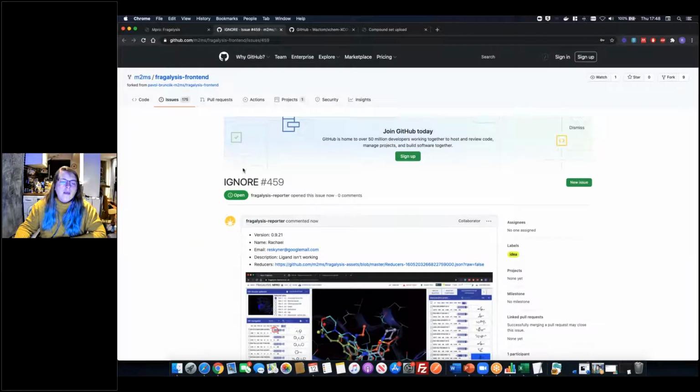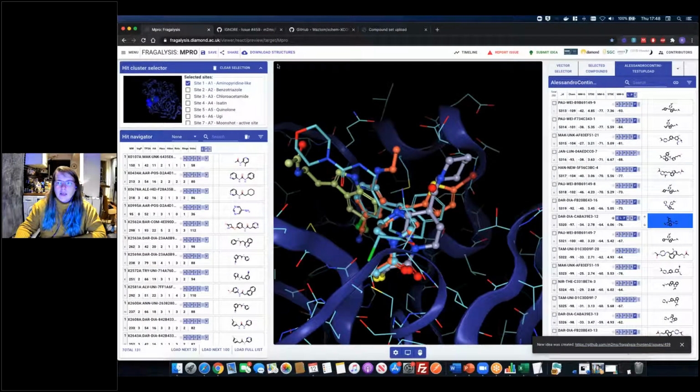And the ideas thing works in exactly the same way. So if you had, for example, a slide or something articulating your idea and you wanted to include that in your image, then when that pop-up comes up to share something, just share that application slide instead and it'll be uploaded.